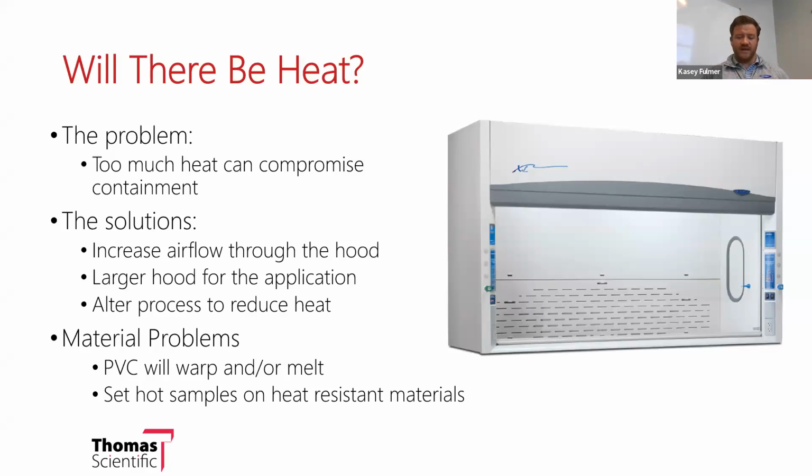If you have really hot samples and you set it on your work surface, it will burn it immediately. So making sure that if you chemically need a PVC hood to be compatible with your materials of construction and you are heating things, you need to make sure that there's a way to accommodate those hot samples, like an epoxy plate or a ceramic plate, something that insulates heat very well, that you can set those on instead of burning your beautiful, expensive work surface. Things to be very aware of, for sure.